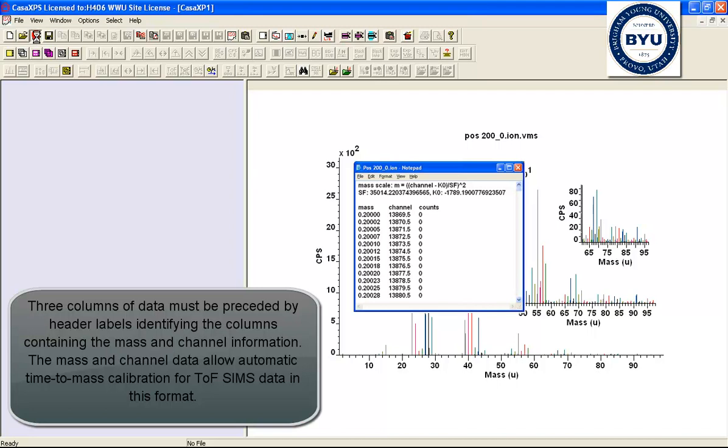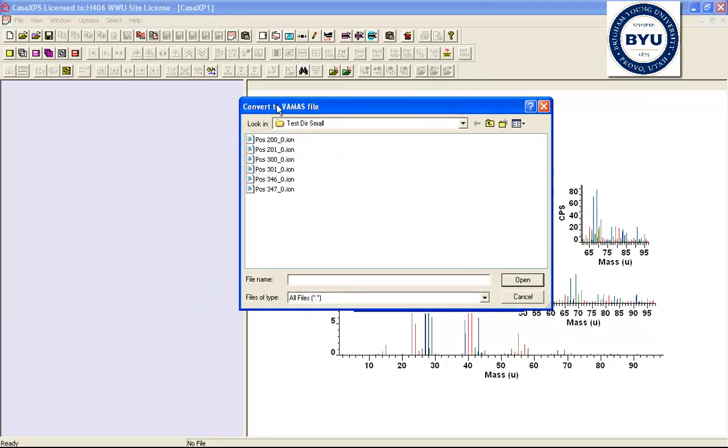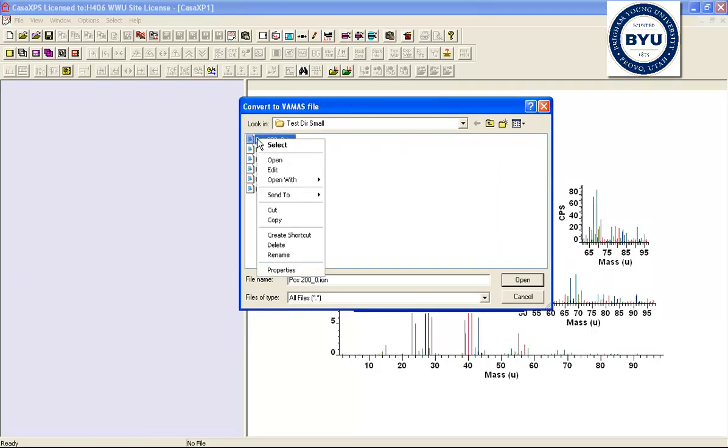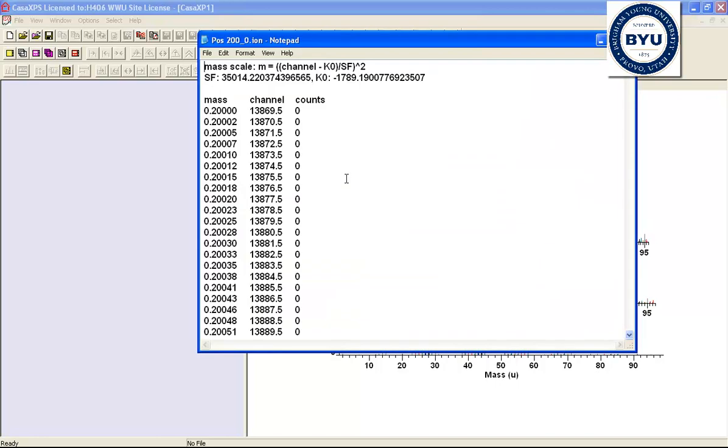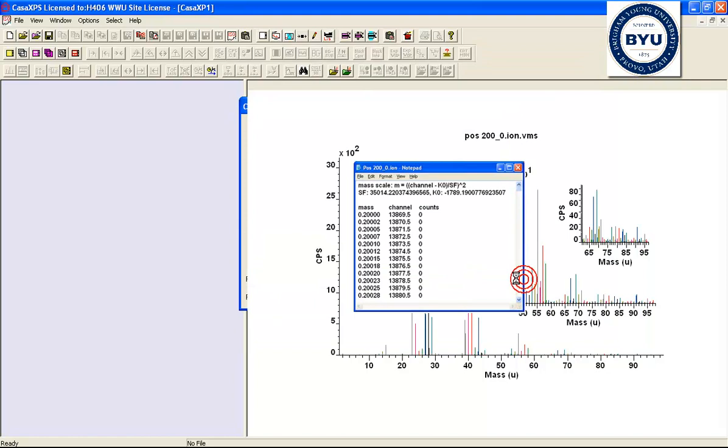If we go to the convert to VAMAS dialog window, you can see this directory contains .ion files. These files are ASCII files that contain the mass information, the channel information, and the counts. When we select one of these files and press open, the file is read and the mass spectrum opens in CASA XPS.